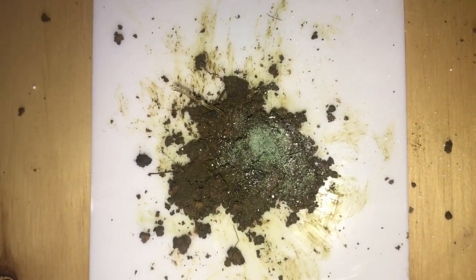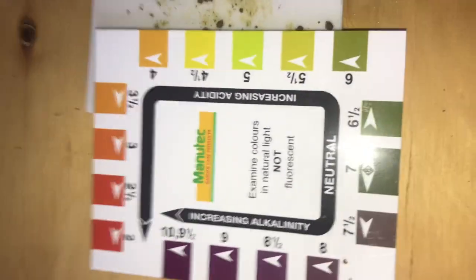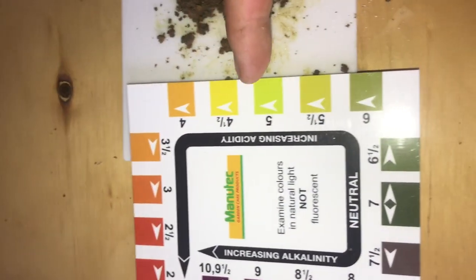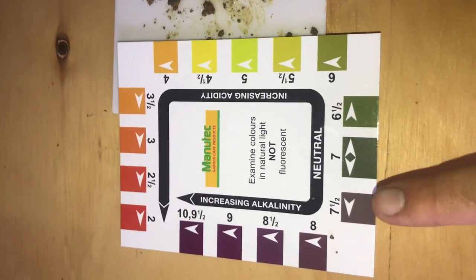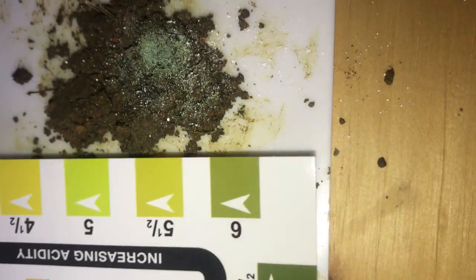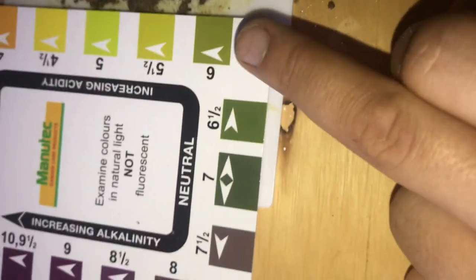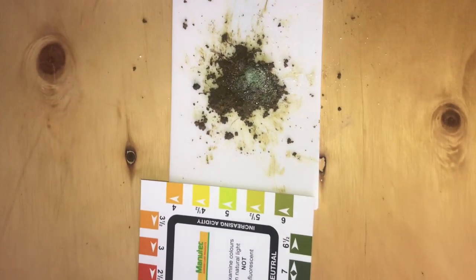Now that we have let the sulfate settle, we can compare the sample to the pH colour chart here. As we can see, our more acidic colours are in the reds and oranges, leading from the yellow to green. All of our neutral colours are down here, and all of our alkaline colours are here in the purples. As we can see here, it's quite a green colour, and I would compare it mostly to a pH of 6. So sitting just below our neutral 7, we have a 6 for our sample. And that is how you complete the pH soil testing.